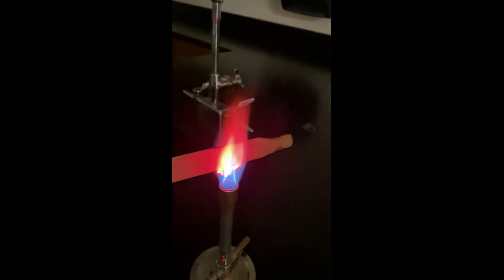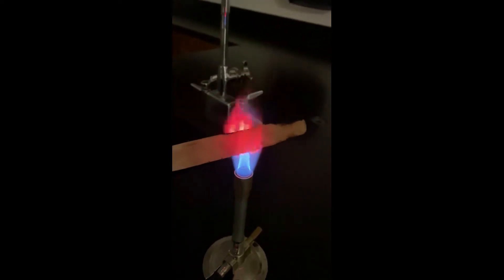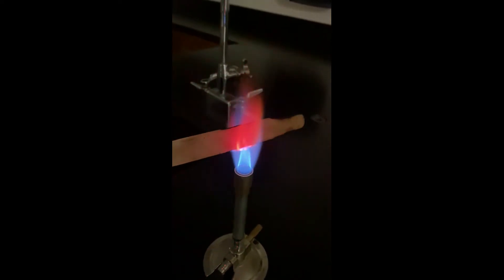And then remember number seven is our unknown substance. So it is going to be a repeat or a duplicate of one of the ones we've already done. So take a look at this color and see if you can match it up with one of the ones we've already shown you today.